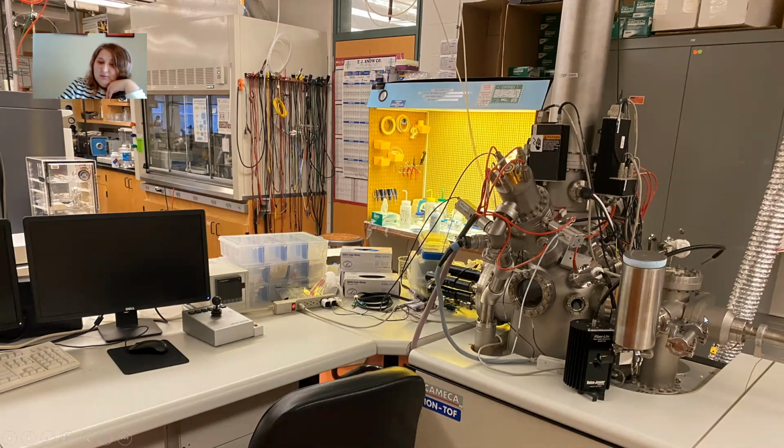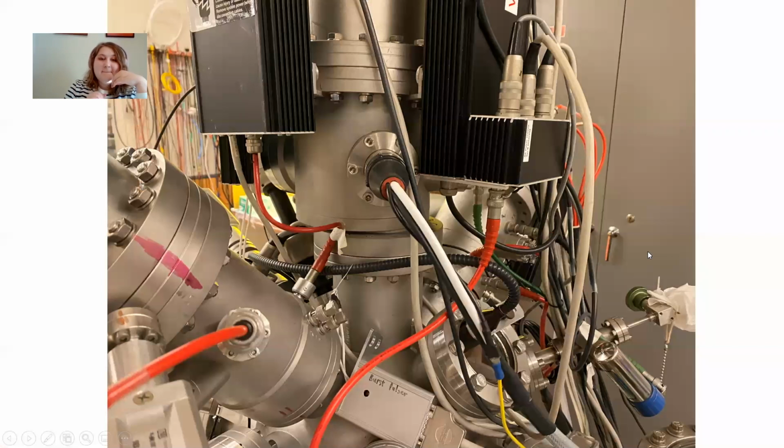And then this is the chamber where you insert the sample. Here's a sample rod, and you insert it into this chamber first, pump it down, and then next into this chamber. This is just another picture, a closer up view of all the different things that are connected to the instrument. Most of these are different gauges and things like that to maintain the vacuum, which is very important to maintain.